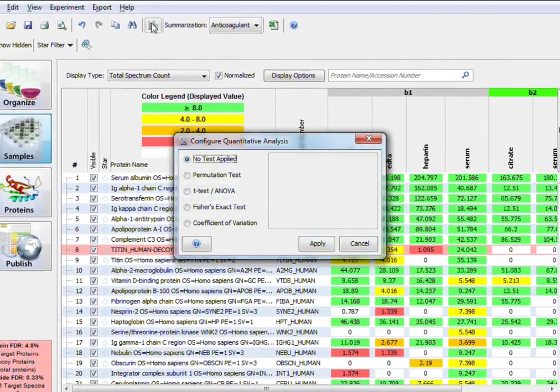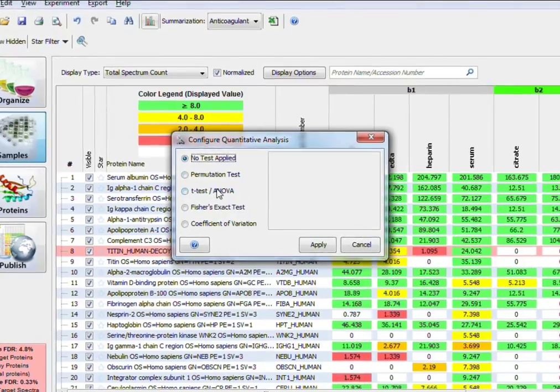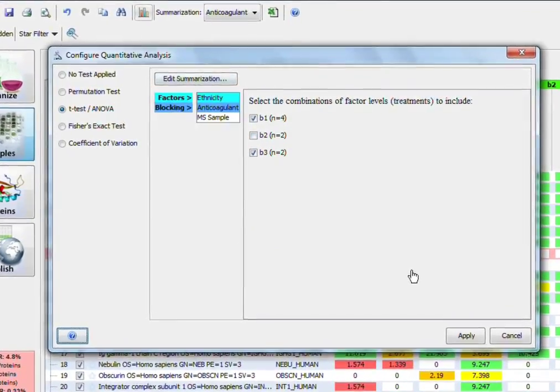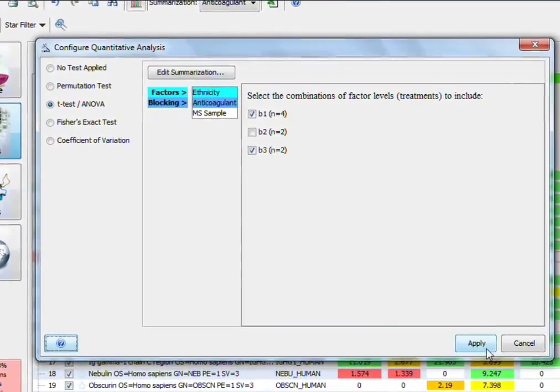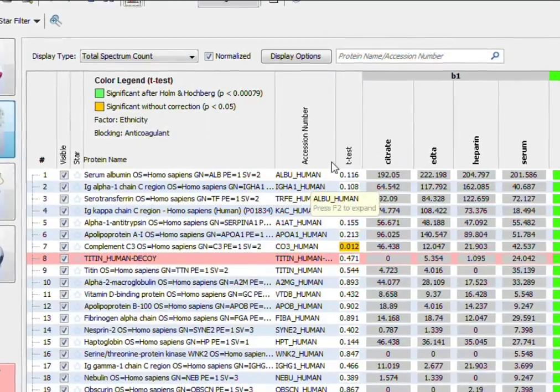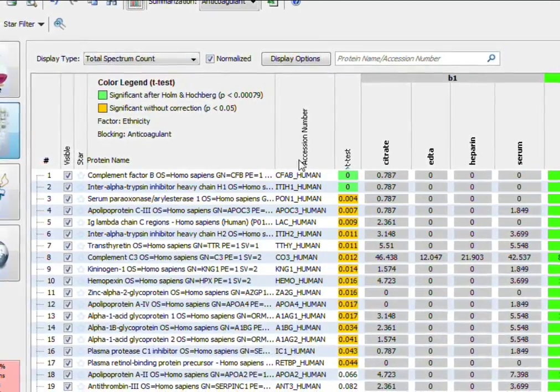As you see which proteins and attributes are uninteresting, sometimes keeping those proteins around is cumbersome.